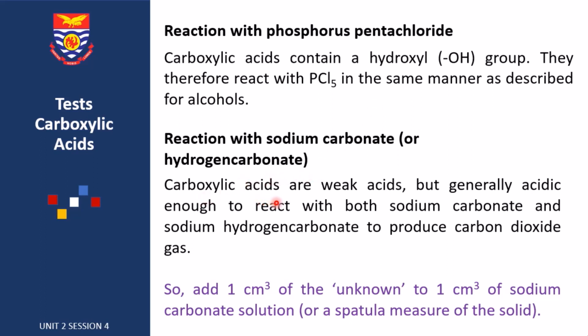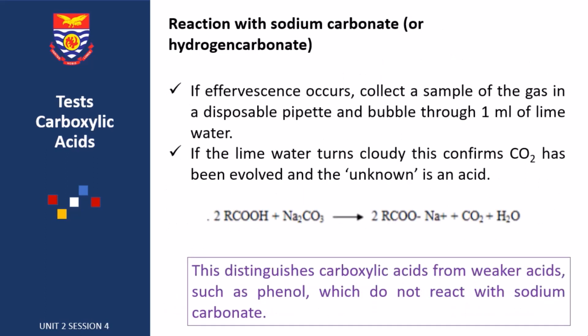So carboxylic acids are weak acids, right? But generally they are acidic enough to react with both sodium carbonate and sodium hydrogen carbonate to produce carbon dioxide. Right? So by adding 1 ml of your unknown and then adding 1 ml of sodium carbonate solution or sodium hydrogen carbonate solution, the positive result is the formation of effervescence.